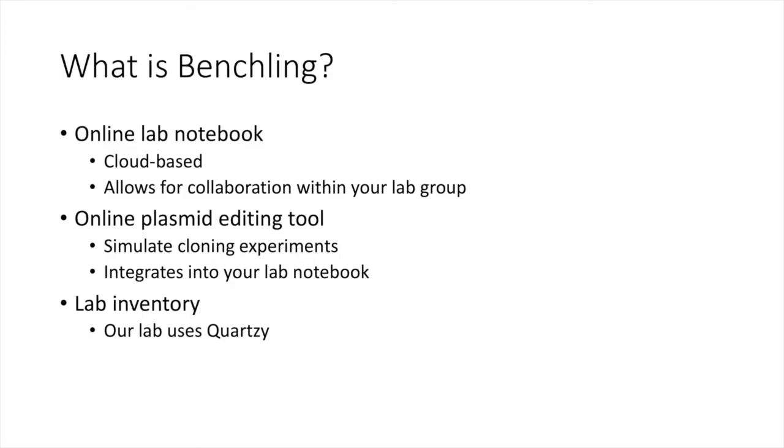Benchling can also be used as a laboratory inventory. Our lab uses Quartzy, so I won't be going into this feature today. So now I'd like to switch over to a demonstration.